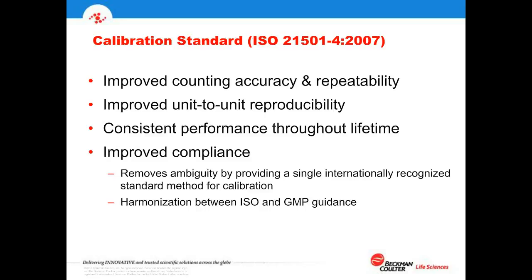One of the challenges always with particle counters in the open air is they never sample the same sample between two instruments. We can't pass in series a sample through instrument A and then the same exact sample through instrument B. So there's always that bit of challenge that the air that we sample is never precisely the same for the two, but we'd like the instruments, if we could force them to sample the same air concentrations, to really read the same, and that's part of the effort in this counting efficiency step of this method.